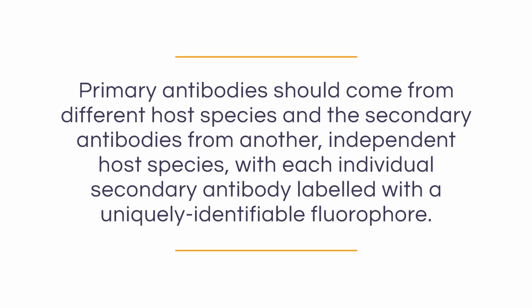For multiplex detection to work well, you should always first check that each of your primary-secondary antibody pairs will be specific and do not result in non-specific bands. Also remember, when probing for targets which have the same or similar molecular weight, primary antibodies need to come from different host species, and the secondary antibodies need to come from another independent host species, with each individual secondary antibody labelled with a uniquely identifiable fluorophore.